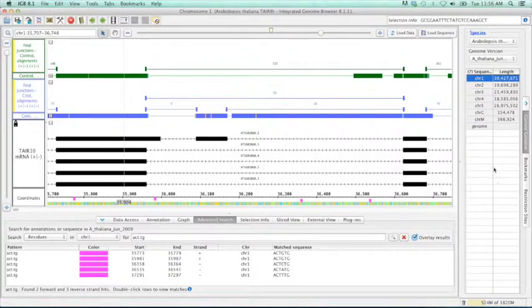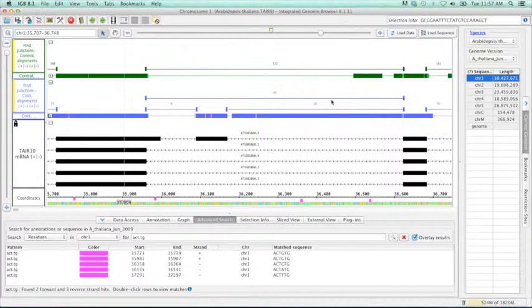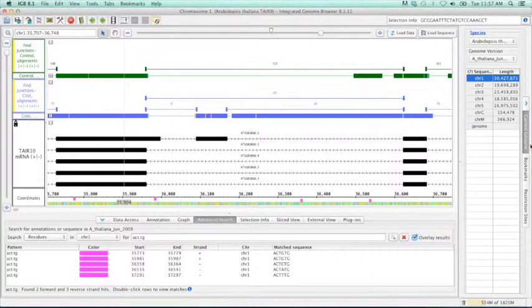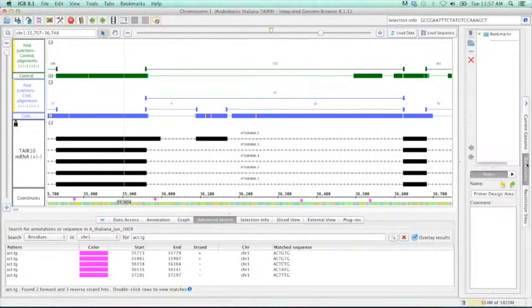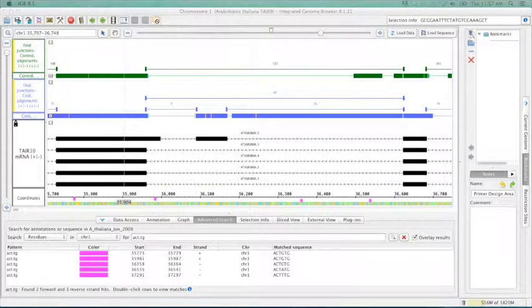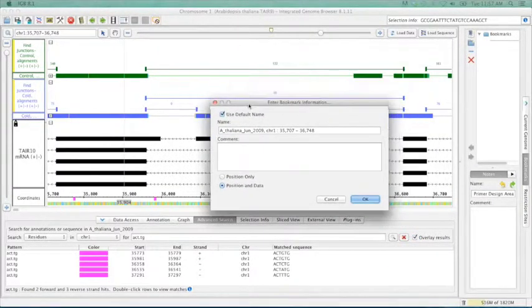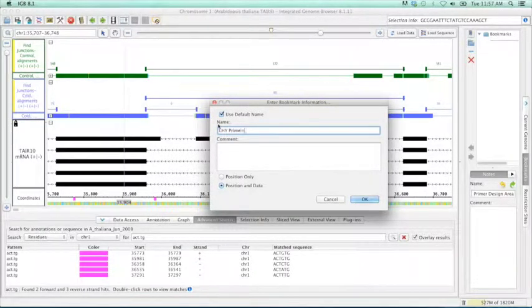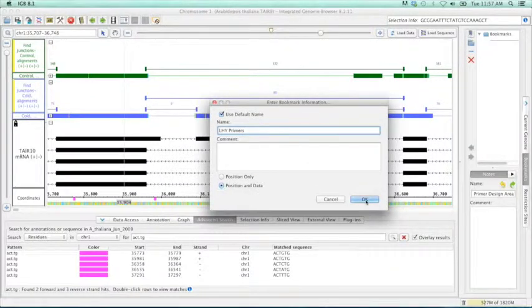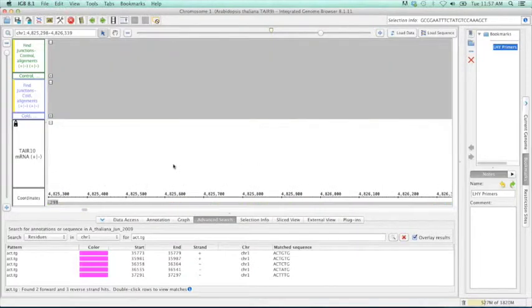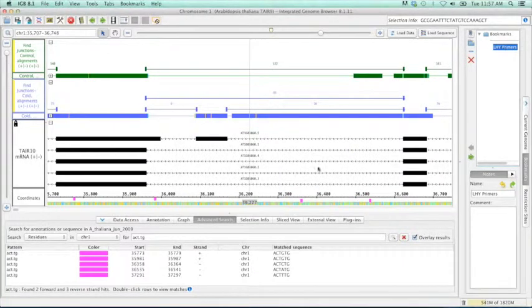And then lastly, let's say that we wanted to be able to quickly get back to this region and look at it, maybe load some data. This is really easy if we use the bookmark function. Over here on the right, we have this tab here, current genome, that we're currently in. I'm going to click on bookmarks, and then I'm going to create or add a new bookmark at this location. And so we can just call this, let's say, our LHY primers. And I'll leave it at position and data. Hit OK. So now if I bump my elbow and I come flying over to somewhere here, I can just go right up here. Double click on this. Hit OK. And we're right back where we were.